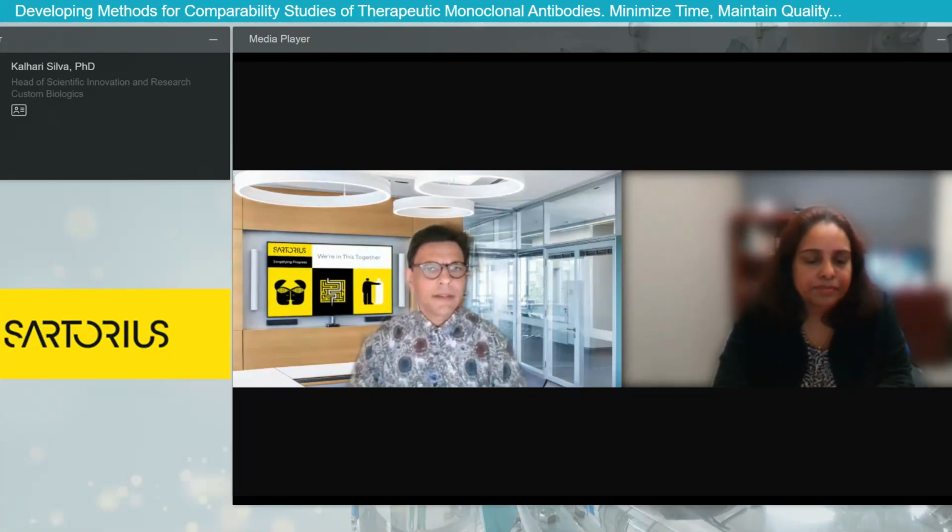Okay, thank you. And in some of your slides, we saw sensorgrams. What does it mean to have negative binding? Yeah, so negative binding we observe when there are larger molecules on the biosensor surface that could result in a negative shift rather than a positive shift. Sometimes the negative shift can also happen when there's a conformational change happening on the biosensor surface. Has the protein, as a dimer protein, dissociated in some way? Then you would see a negative shift as well.